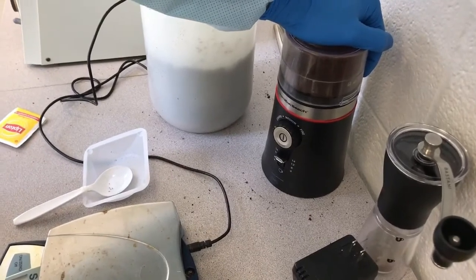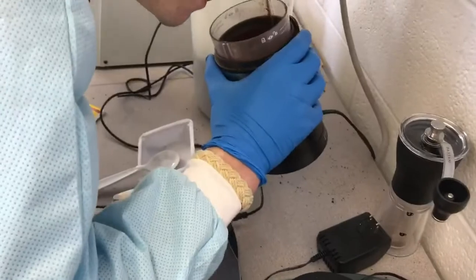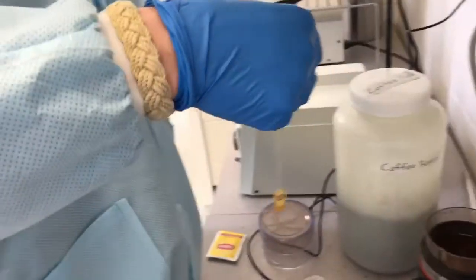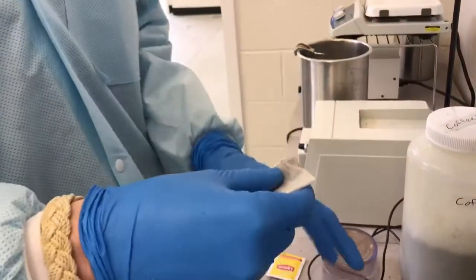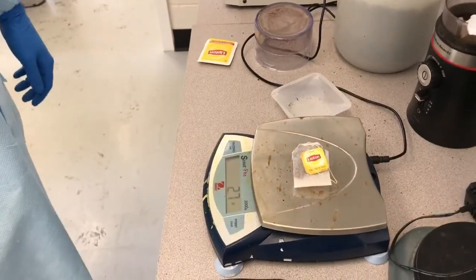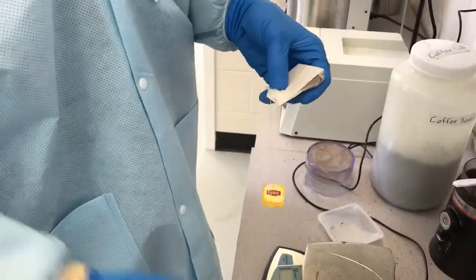Select your coarseness setting and be sure to take a whiff of some of the finest coffee E2 has to offer. Place the coffee beans into the bag at your desired weight. After you reach your desired weight, it's time to staple that bad boy up.